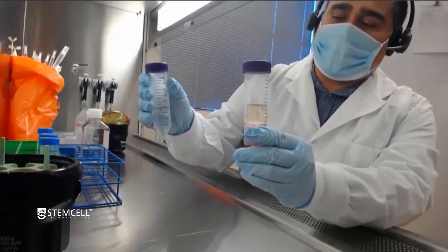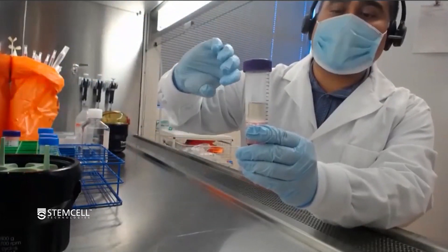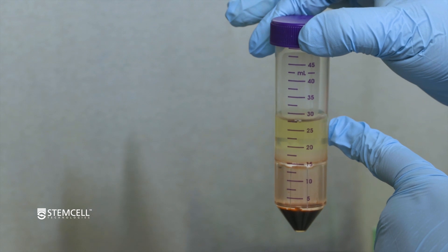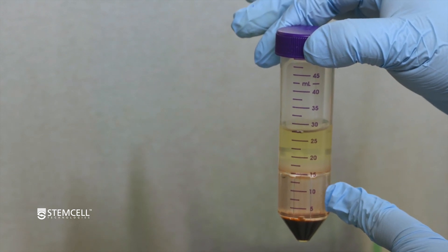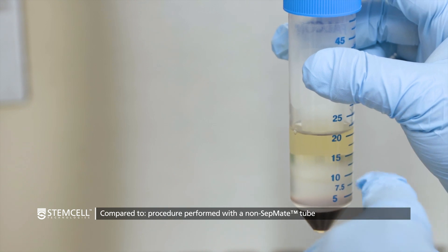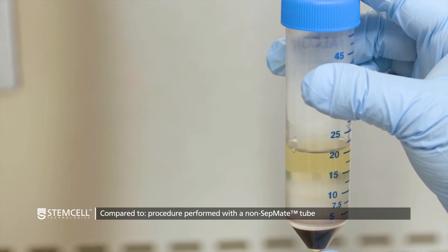You don't want to be hesitant, because if you're hesitant when going through the diagonal, that's exactly when the layer underneath can come out. Do one smooth motion, hold it upside down for one or two seconds, and then back. After you take your CEPMATE tube out of the spin, you'll have a yellow diluted plasma layer at the top, then a slightly hazy white layer which are your desired PBMCs, and just below that the density media plus your red blood cell and granulocyte pellet at the bottom.